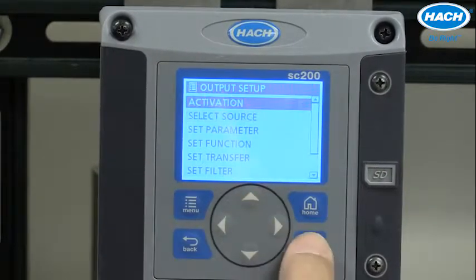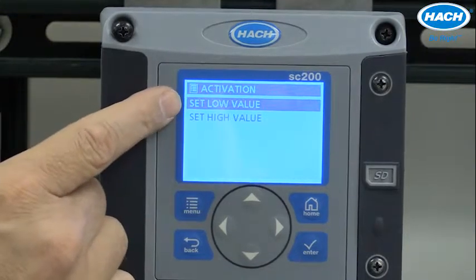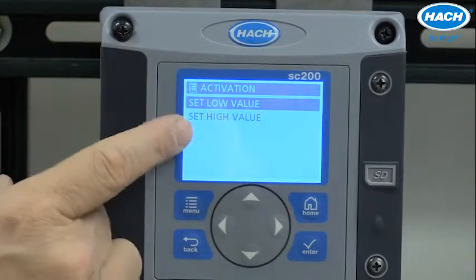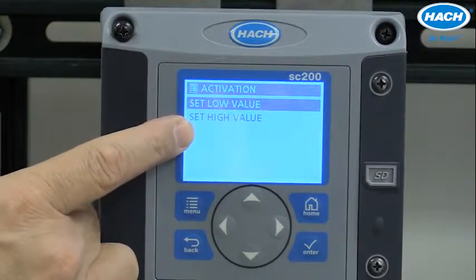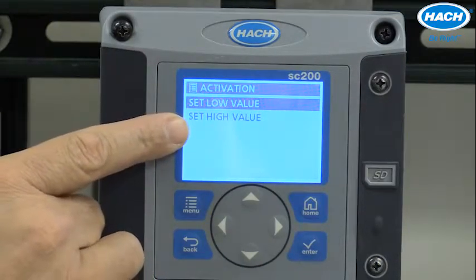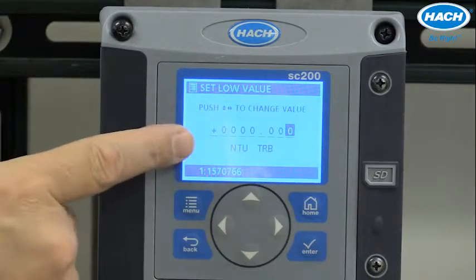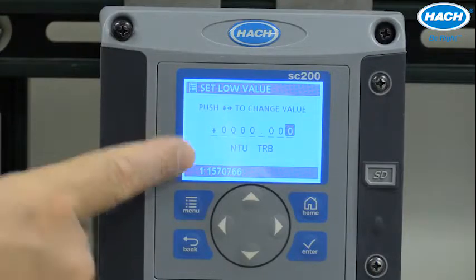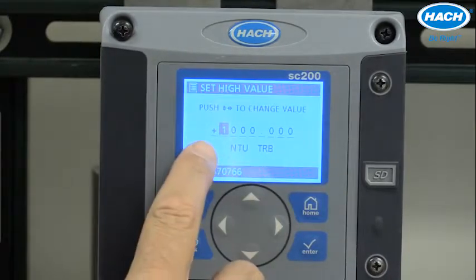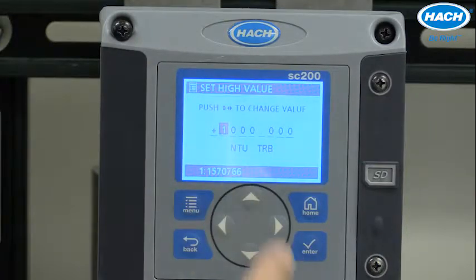If we scroll back up to activation, these are the most important two settings: the low value and the high value. The low value represents the turbidity in NTU that will be proportional or equivalent to a 4 milliamp output current. The high value is the turbidity in NTU that will be equivalent to a 20 milliamp analog output. We want to make sure these are appropriately set so they communicate well with a digital control system. The low value, by default, is zero NTU — adjustable by the user, but normally zero NTU is appropriate. Scrolling down to the high value, by default it is set to the full maximum operating turbidity from the sensor, in this case 1,000 NTU.